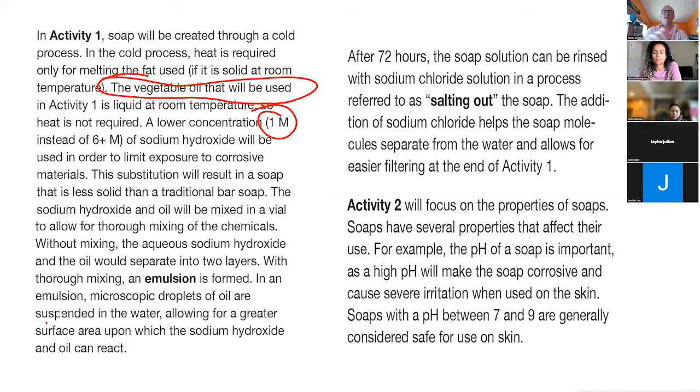And then after 3 days, what'll happen is that a soap layer will form. You'll see a sort of solid white soap layer with sodium hydroxide on the bottom of it, because it should be slightly less dense.